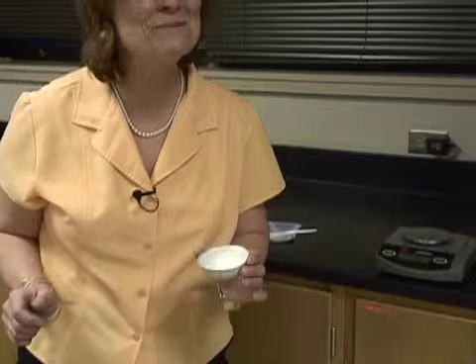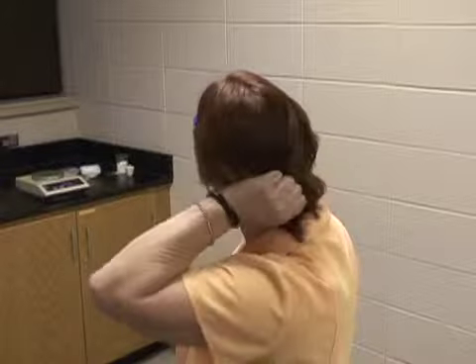Now I get to see the Bunsen burner. Here we go. Oh, here we are at the Bunsen burner. I love the Bunsen burner. Now, I've got my goggles on, as I always should in the lab, but today I don't have to tie my hair back. It's mighty short.